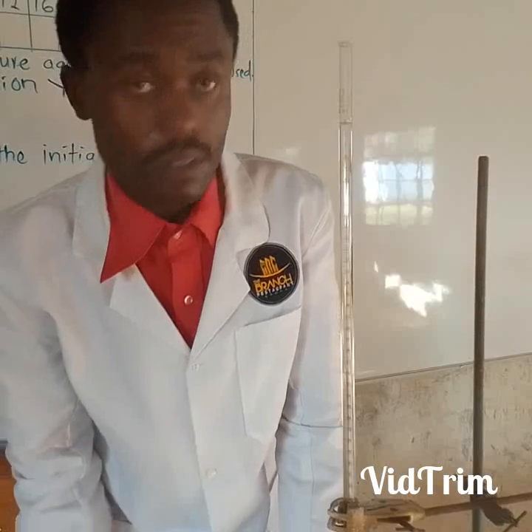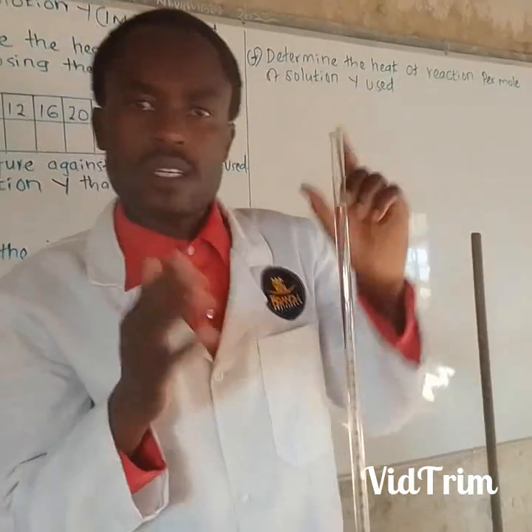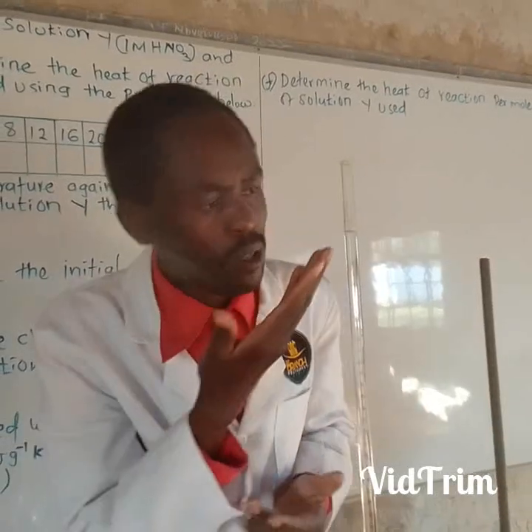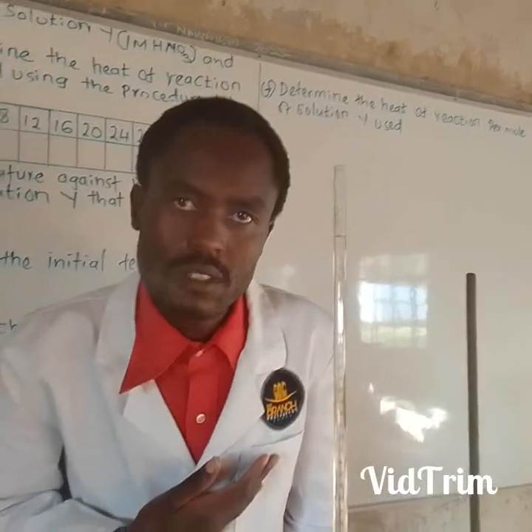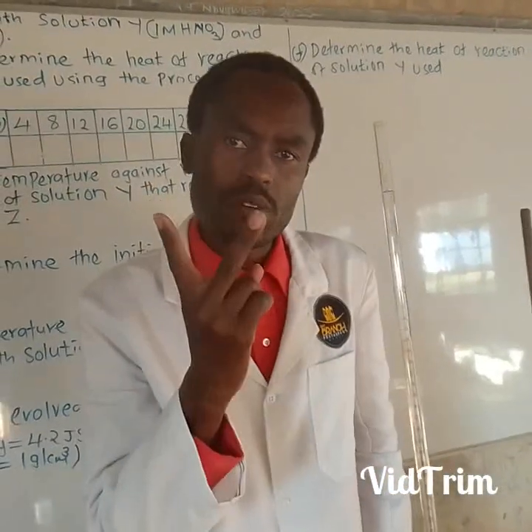So look, when you fill the burette, ensure it is at the 0 mark, and always remember to read below the lower meniscus. Is it okay? So I fill the burette. That's procedure number 1. Then let us now look at procedure number 2.